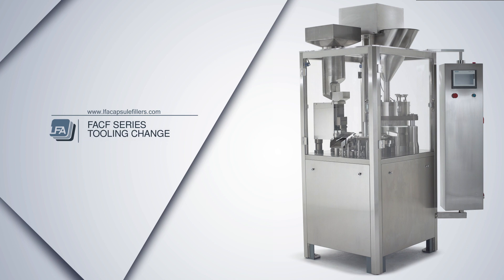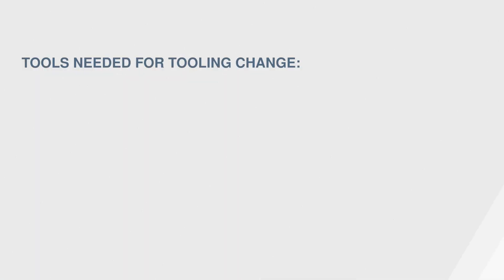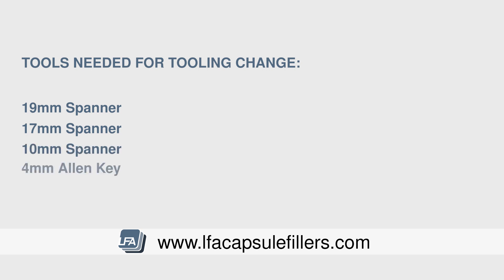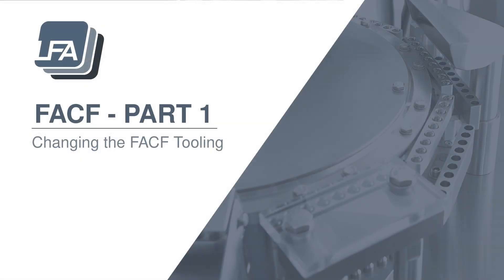Hello and welcome to LFA's video on changing your FACF tooling. Tooling changes happen in three parts. For a tooling change we will need a 19mm spanner, a 17mm spanner, a 10mm spanner, a 4mm and 5mm allen key, as well as your tooling calibration set. When tightening the bolts and fittings on the machine, we always suggest reading the manual for the recommended tensions.